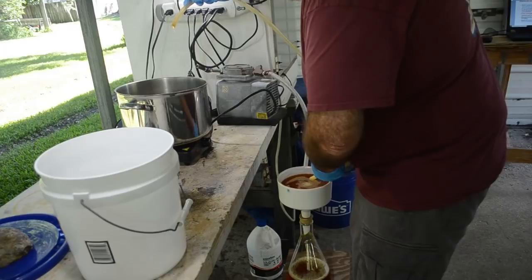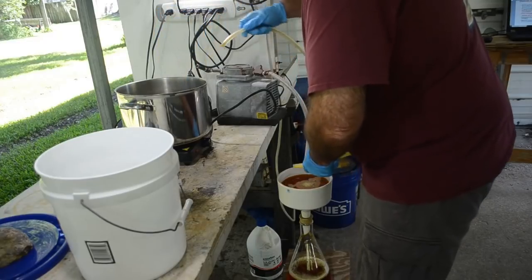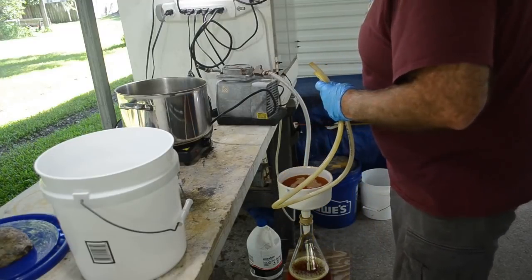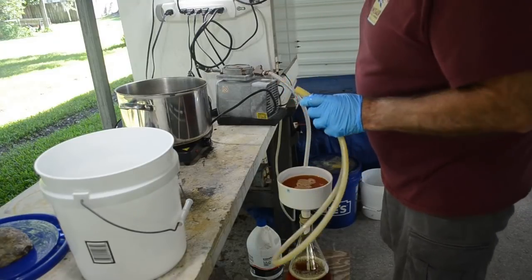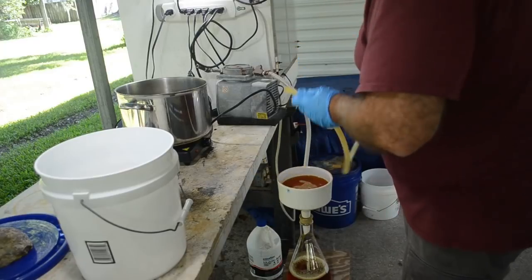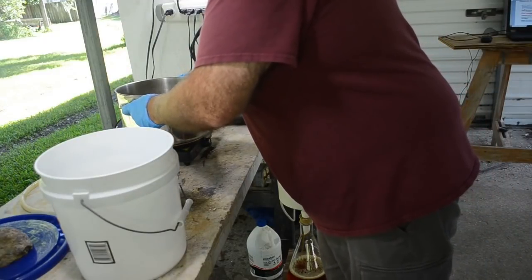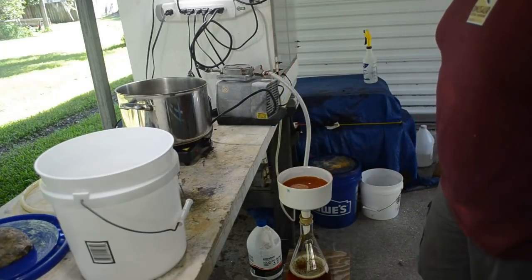Okay. The filtration has slowed down, so I'm going to stop and let what's in the Buchner funnel go through. Get the pregnant solution out of the hose here too. I don't want to overfill the flask down there. And then what's left in here, I don't know. Maybe I'll siphon some more. I was going to say, if I'm really careful, maybe I can pour that in. But, you know, I don't want to have an accident.